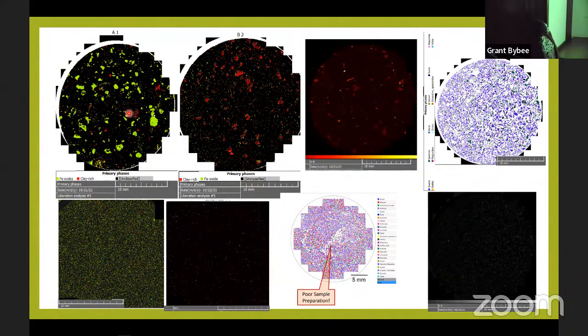And this one is a fly ash from Chris. He wanted to know the distribution of the vanadium within the fly ash. Where is it associated, with what minerals, right? And then the black stuff will be just calcium-rich phases. And then the yellow, so what we did to make this more reasonable was, they're extremely fine-grained, I grouped all the iron oxide and clay-rich minerals so that you can see vanadium is associated with what minerals. It's much better.